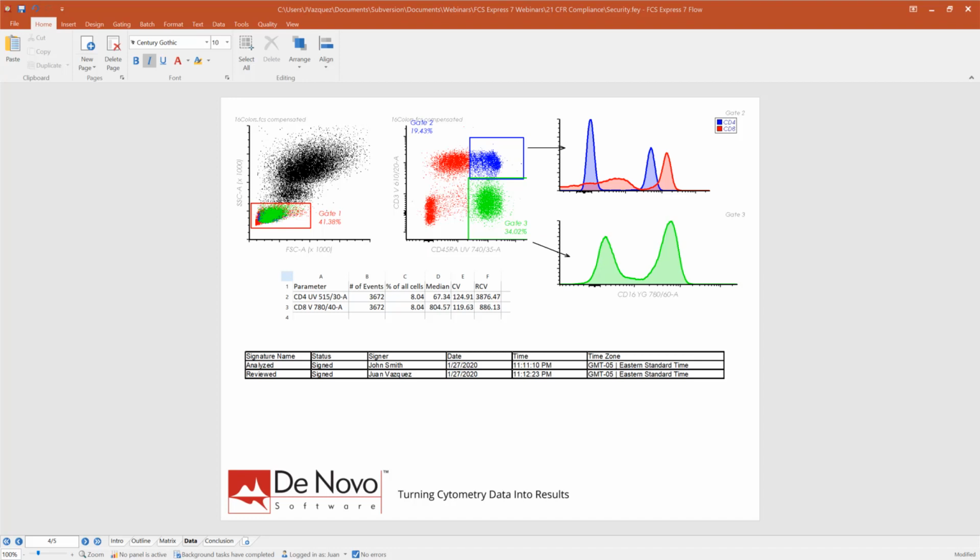Okay, and finally, as I mentioned before, as part of the security license, the user will be required to have a database as a way to maintain this license and keep track of all the different users that are part of this license, all the different actions that have been stored within those full session reports that we just saw. And you can actually find that information on our website.